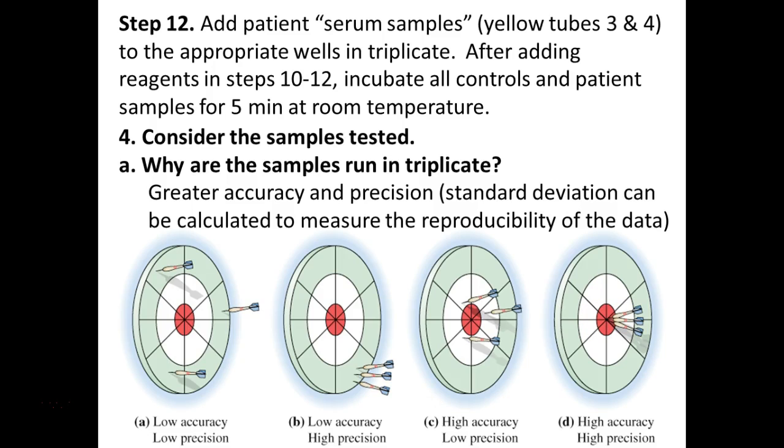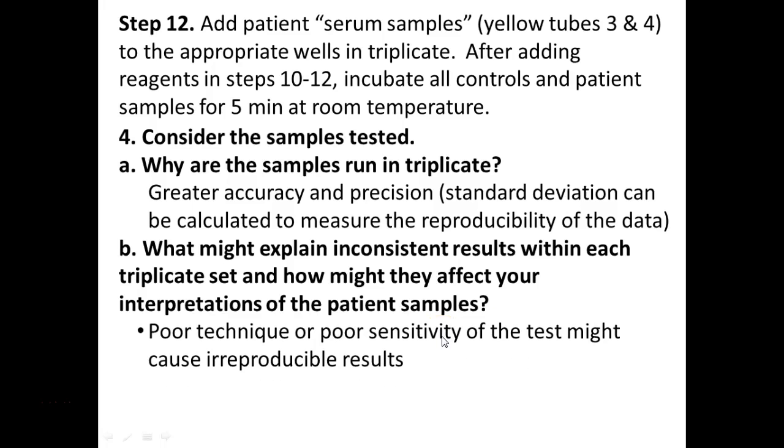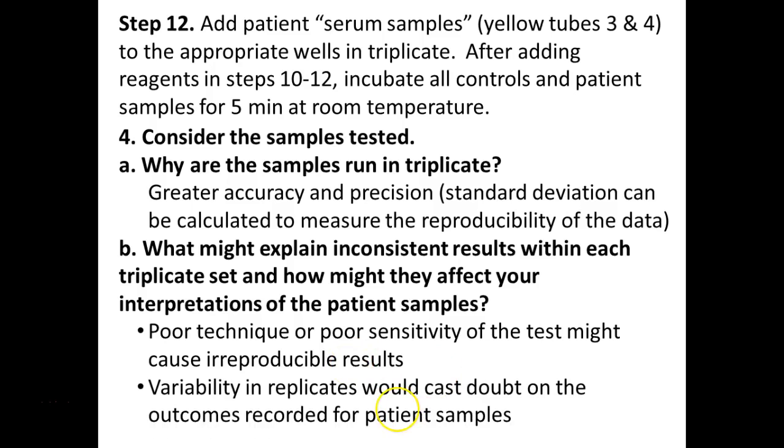For you guys, you're new at this, right? So you may or may not have good accuracy and precision. It comes with technique. Although this is a relatively simple technique. As long as you follow the instructions, we should be pretty good. So poor technique could be the issue, but also poor sensitivity, right? If you don't have enough of the sample in there to create the color change that we need to be able to visualize it. This is a highly specific test, though. We usually don't have issues with specificity.